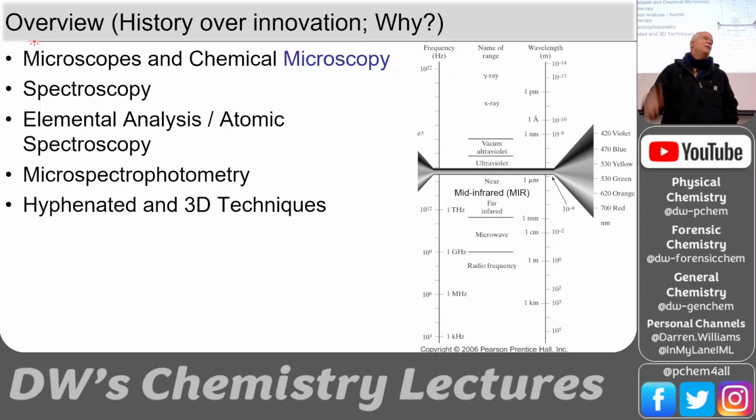Why hasn't it been replaced with all of these fancy new instruments like GCMS and liquid chromatography, time of flight mass spectrometry, and all of these really fancy techniques? Why would we keep something ancient like regular visible microscopy? Yes, it's very inexpensive. Microscopes, just optical microscopes. I mean, you may think they're kind of expensive if you go look at the catalog, but compared to not just the instrument, but the maintenance costs and the staffing for these modern instruments, it's much less expensive. And also it's historical.